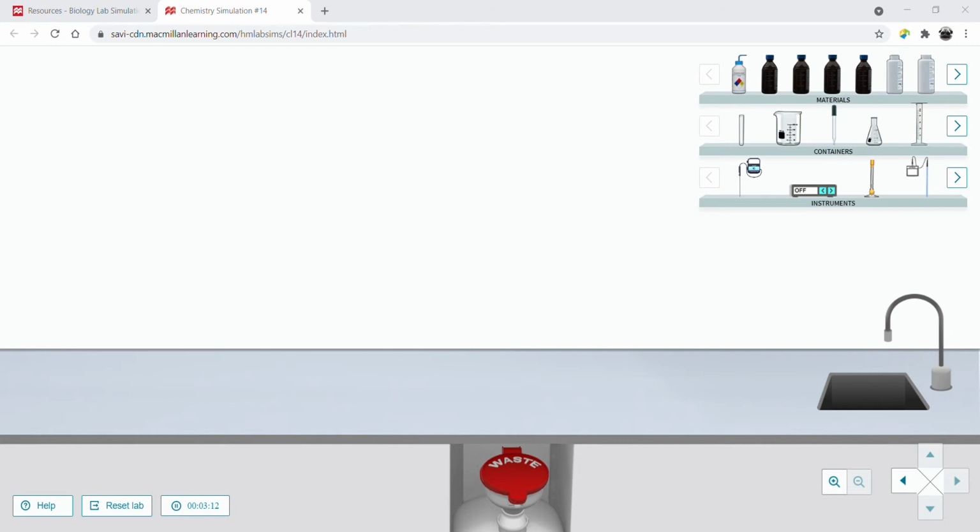For this lab, what you are going to investigate is the effectiveness of an enzyme to break down hydrogen peroxide in 3 different pH environments. If you go to the bottom of page 2 of your lab, you see the chemical reaction that is listed.